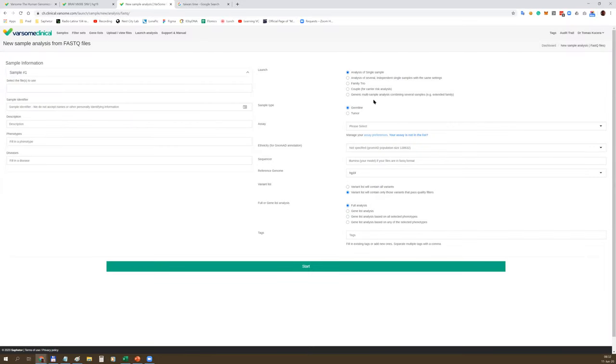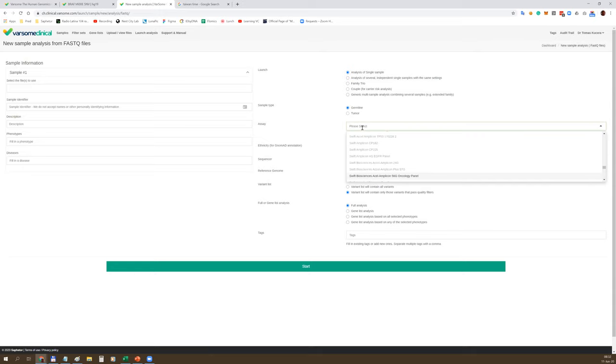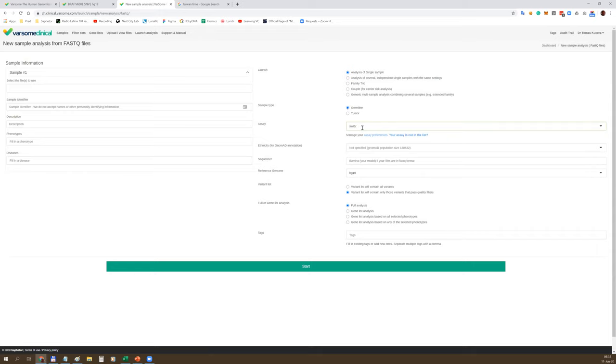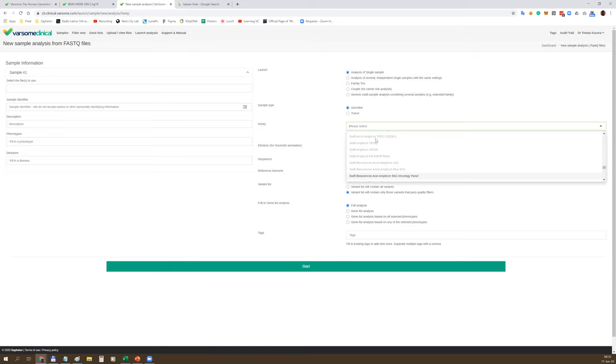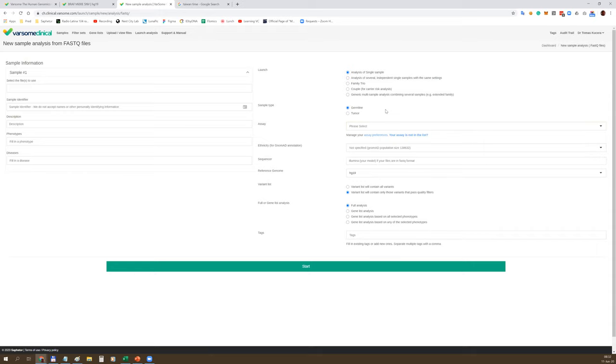Pipeline for copy number variation, structural variation, and so on. Let's say we are starting from FastQ, either from Illumina or MGI. Here you should specify several details, for example whether it's a germline or somatic sample. Here you should specify the assay used for library preparation - that can be any commercial assay such as Swift Biosciences 56G or 57G.